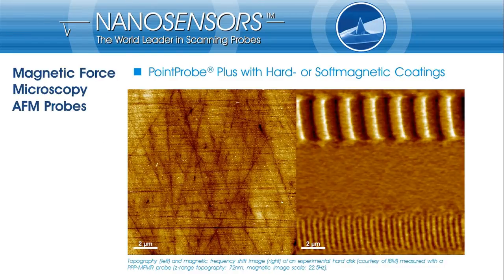Magnetic Force Microscopy, or MFM, allows visualization of magnetic features at a sample surface, independent of surface topography. This example shows the visualization of magnetic bits at a hard disk. The left part of the image shows the topography of the hard disk surface, and on the right the magnetic features written onto the hard disk are visible.